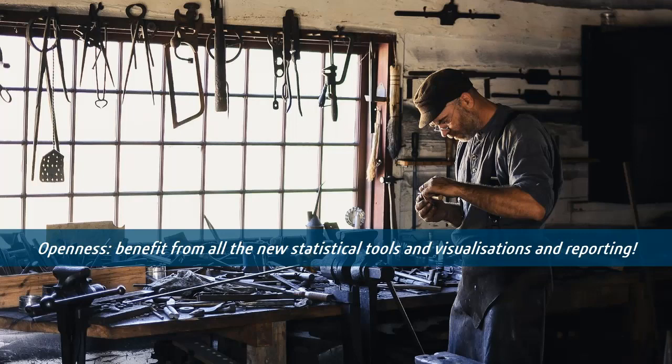Let's move to the next part, because what I showed here is really just running through a predefined process, which is great when you're really in execution mode. But nevertheless, before that, you need to be able to handle those numerous types of assay that I mentioned before. And I would say in most cases in science, every case is specific. So you need a way to have an open system.